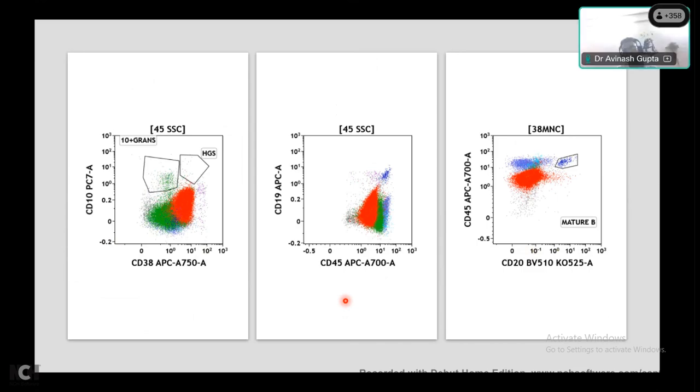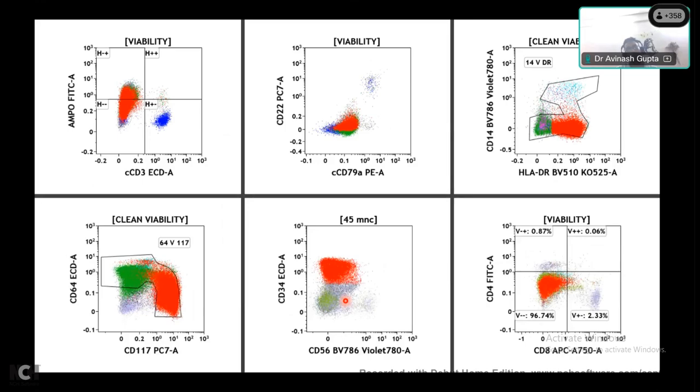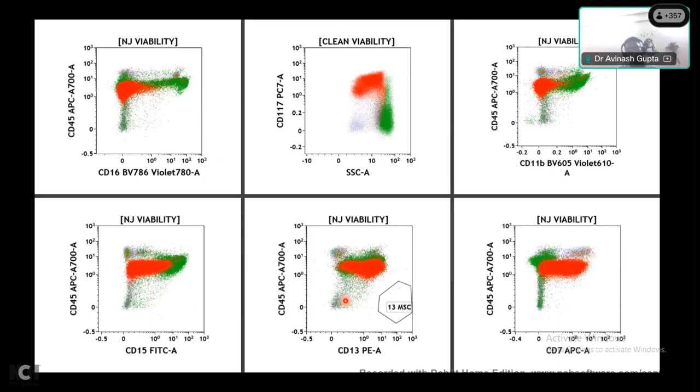But if you see the immunophenotype this way, it can point us to a particular abnormality. There is data that a CD34 positive population, which is CD15 positive and CD7 positive, and showing a little bit of erythroid maturation, in your previous slide we saw that the marrow is not entirely replaced by the blasts.